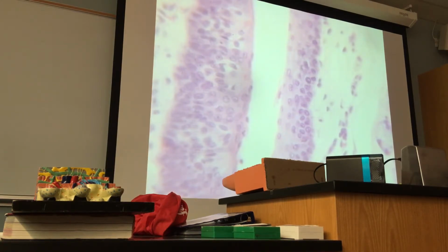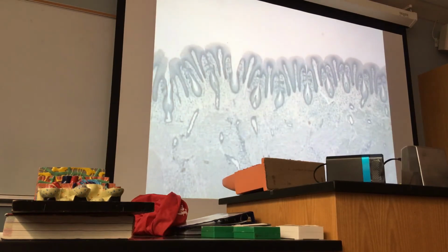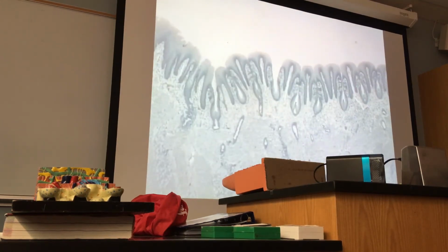But I'm going to show you the mother of all taste buds. And they are wonderful. So here we go, because you might have to identify a taste bud. These are all circumvallate papillae, or vallate papillae.